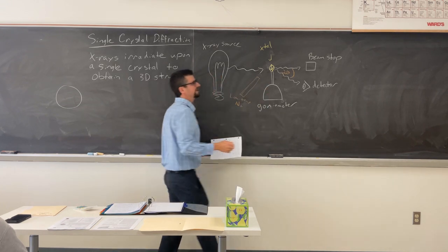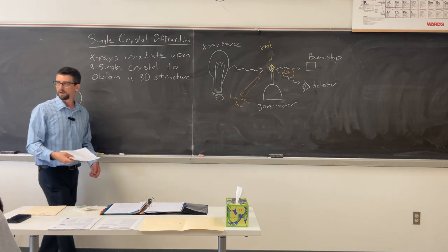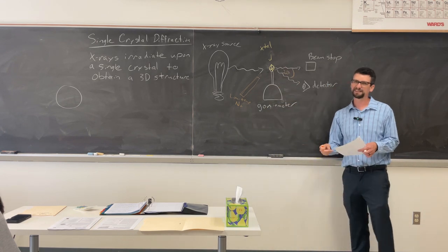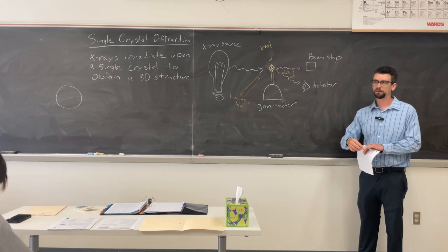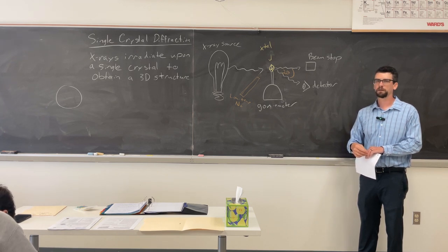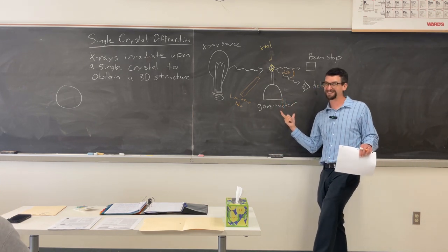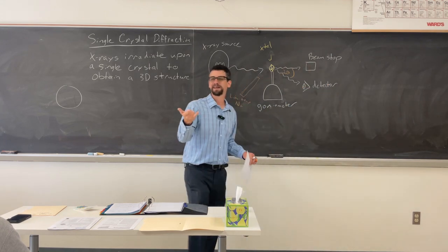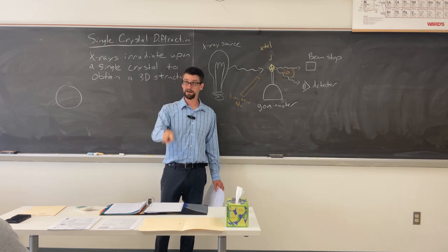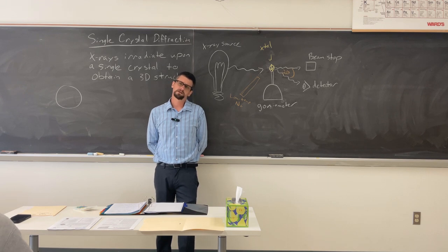Okay, now when we do that though, there are a couple problems that we may introduce. You might hit the nitrogen, so that might mess with stuff. A lot of times it ionizes. What other problems would you see with that? Yeah, actually, liquid nitrogen's not too bad compared to the rest of this instrument. You do have to have it. So in a rural location like this, we've got 2 places to pick from to have liquid nitrogen, which isn't great. So that's not too bad.